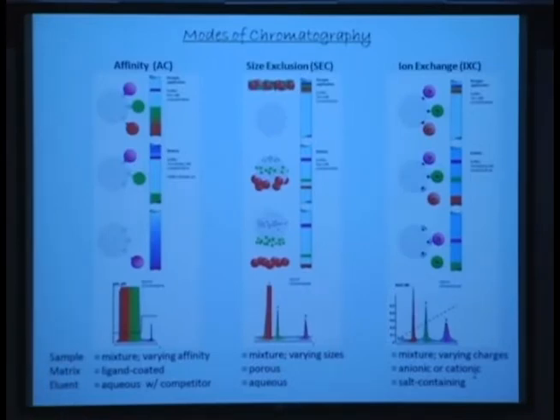What typically happens is that you release the one that actually binds last, and it arises as a relatively small peak, which is the high affinity molecule that binds the receptor. The rest of the fractions that do not bind the receptor simply flow out in the initial buffer. And that indicates that this particular molecule is the one that has high affinity for the receptor that you have chosen.